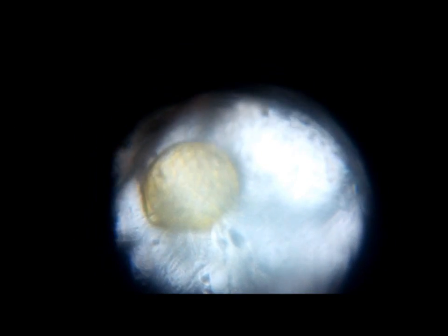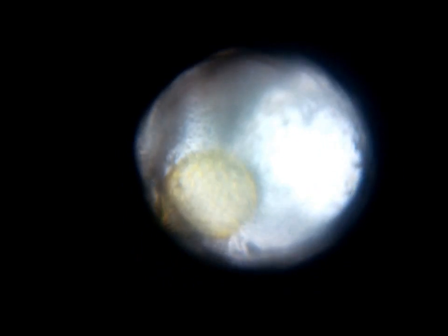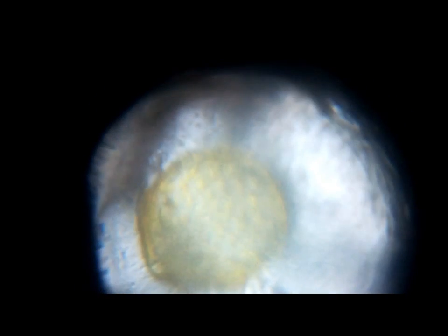So here you can see the green large pollen grain of Mirabilis dicot flower. Notice some spots, very light spots all over the sphere. These can be identified as the germ pores on the hard covering of the pollen grain.